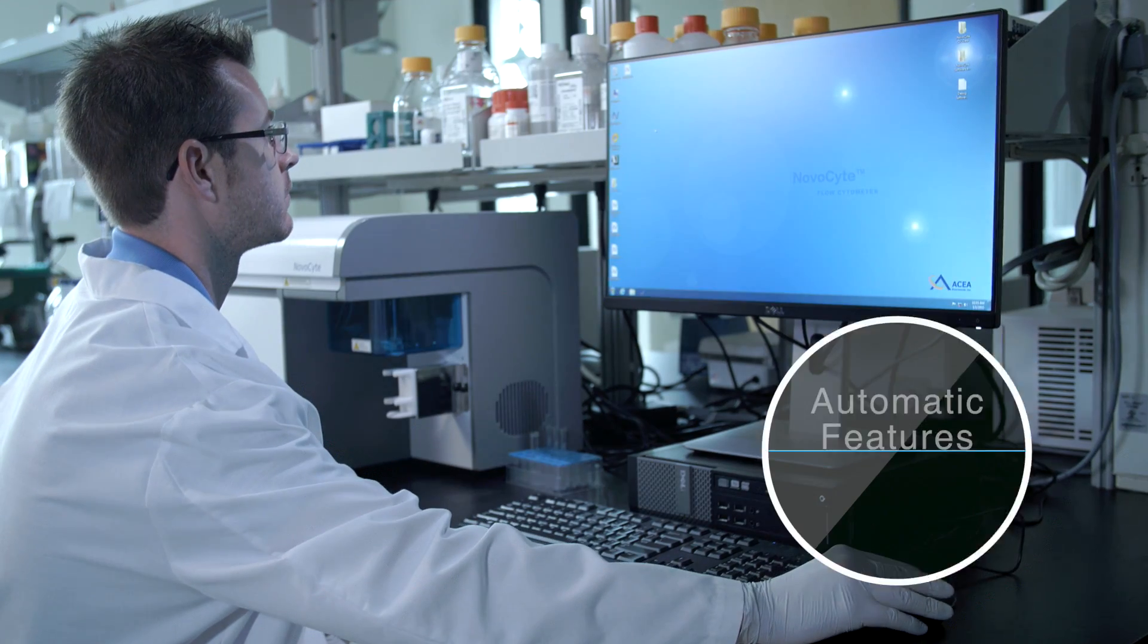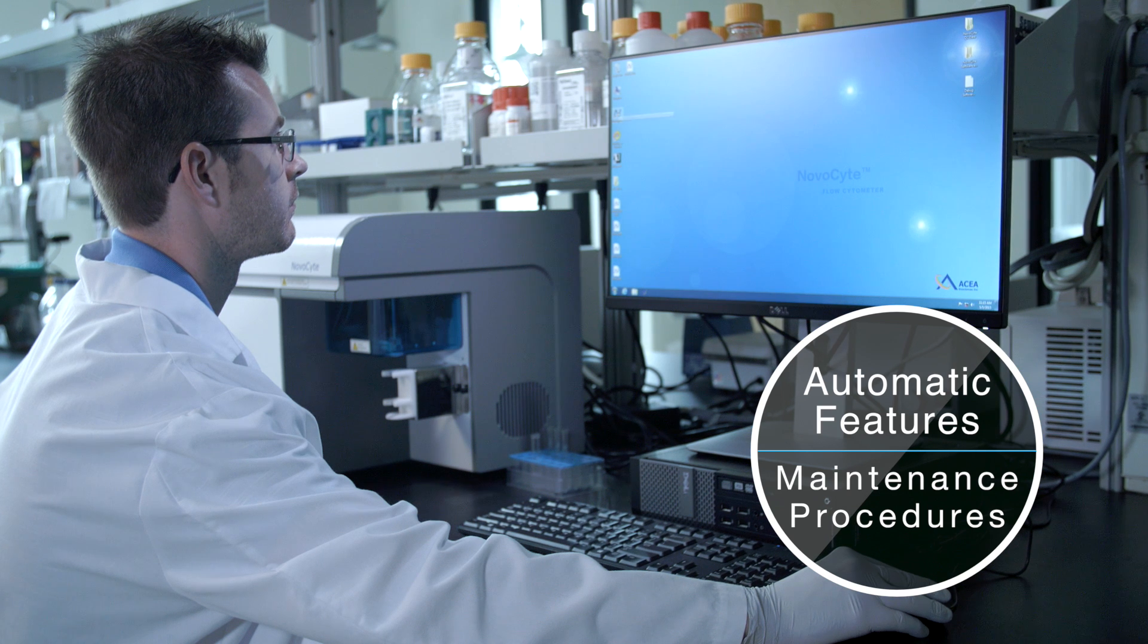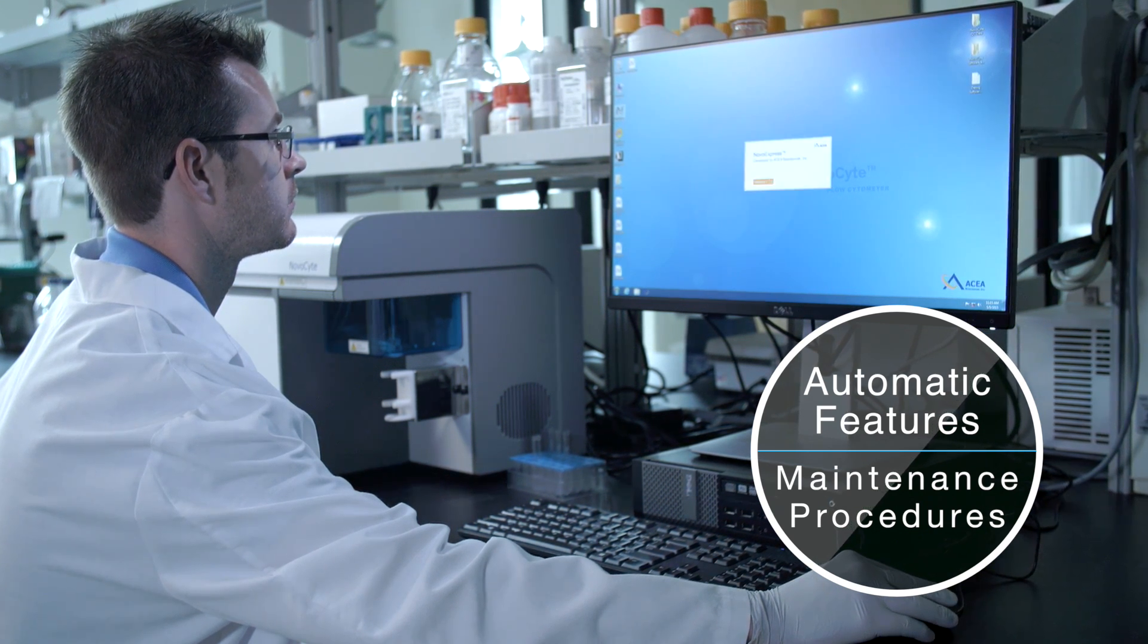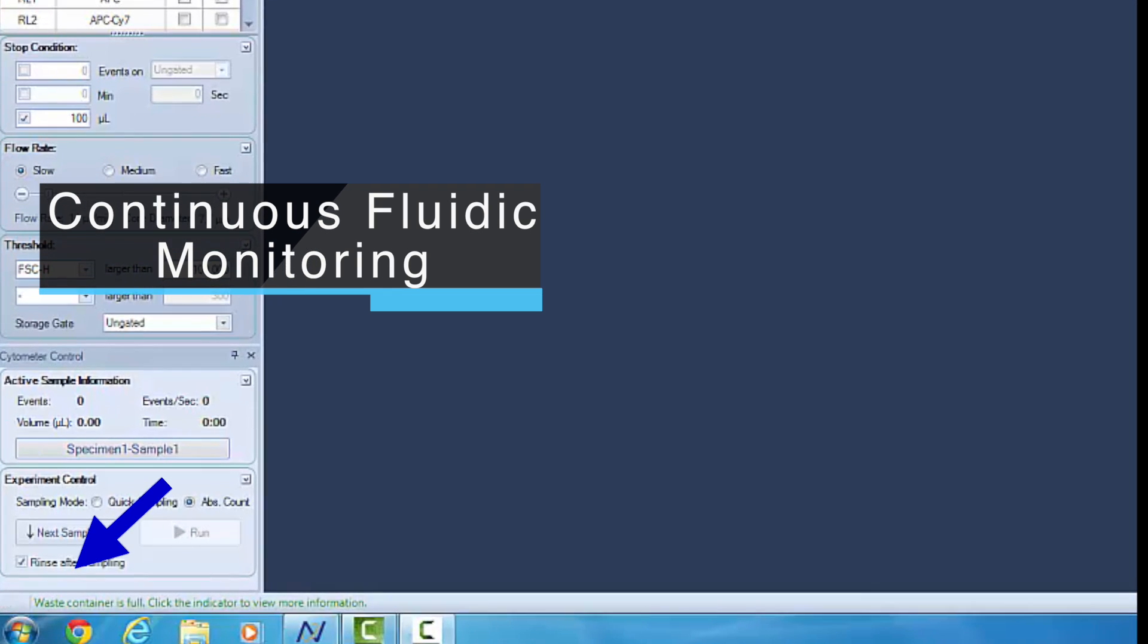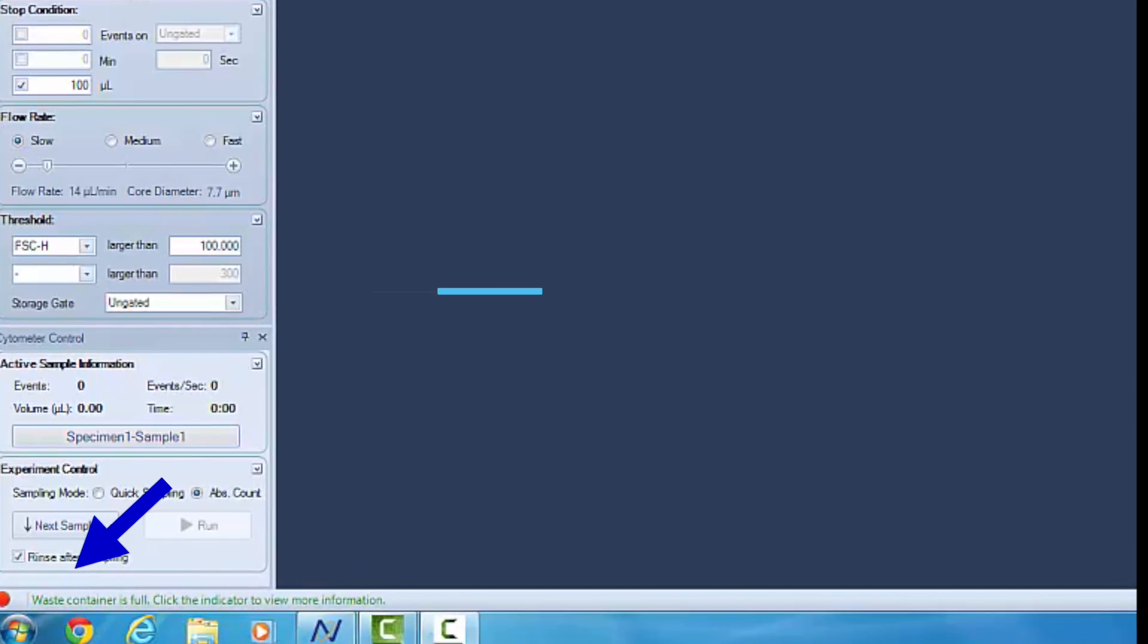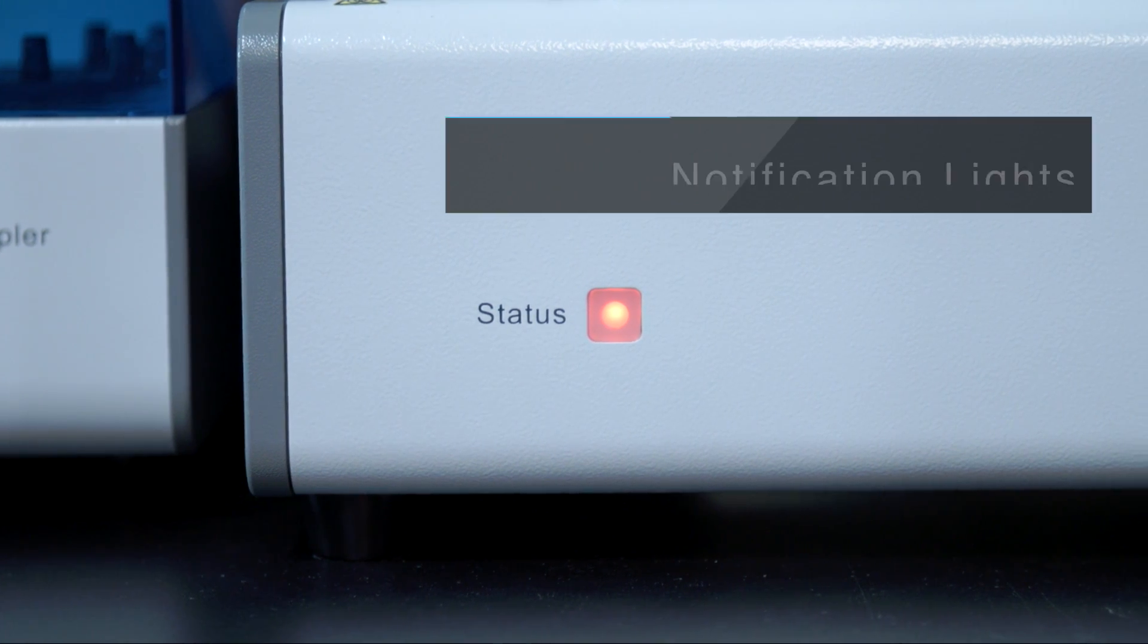Novo Express incorporates many automatic settings to help make maintenance as hassle-free as possible. All of the fluidics are continuously monitored for low levels or when the waste is full.